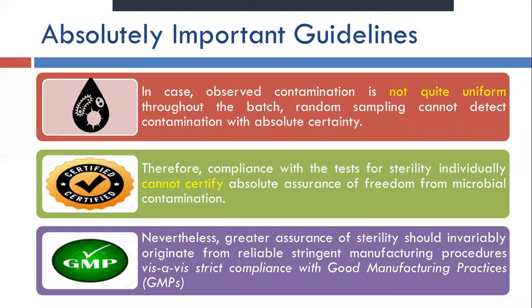The result comes, the sterility test passes. But what is the guarantee? I have already told you what could go wrong during sterility testing. So even when your sterility test passes, what is the guarantee that the whole batch is sterile?